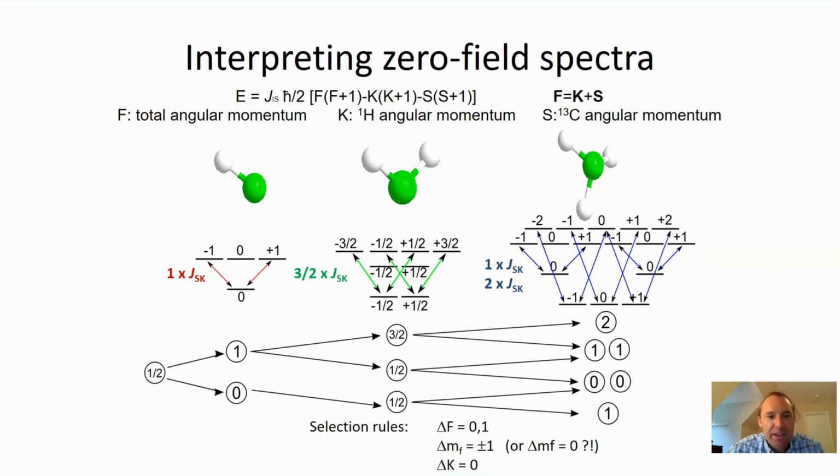which is why those are the locations where these lines appear in the NMR spectrum. The other thing that becomes very important here are the selection rules. You can see, for example, I didn't draw any arrows between the top spin 1 and the spin 2 manifold, and that's because the selection rules do not allow this transition to be observed if you evaluate the transition dipole moment.